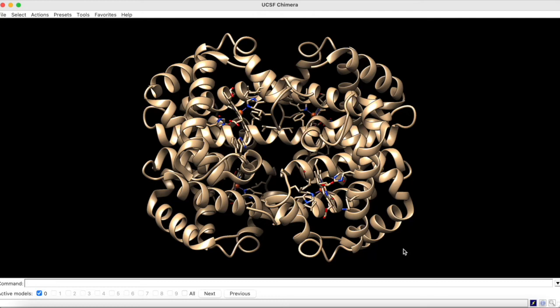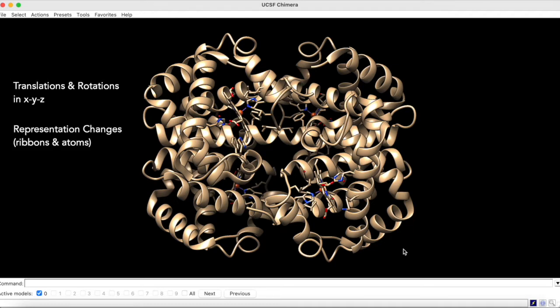In Chimera, you can animate structure translations and rotations in XYZ, changes in the representation of ribbons and atoms, changes in opacity and color, and more.